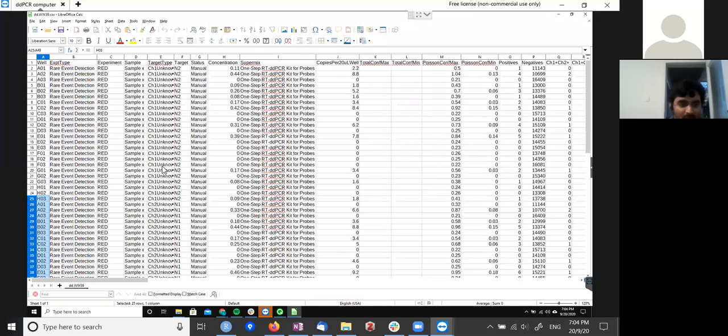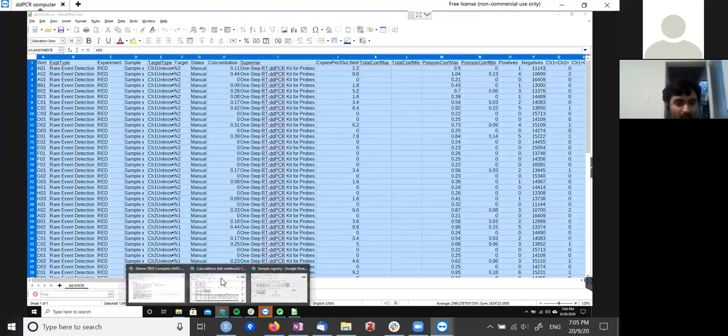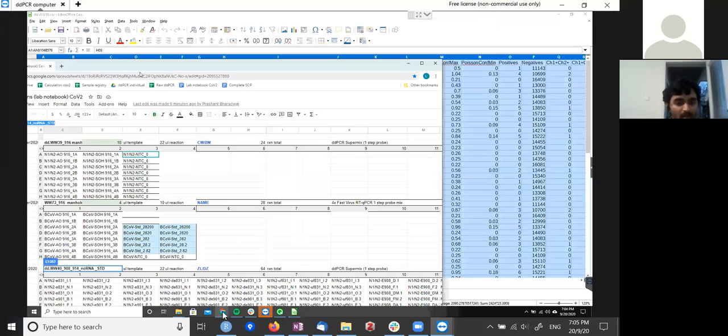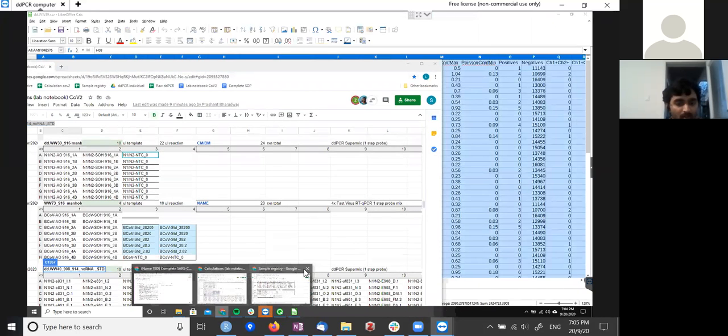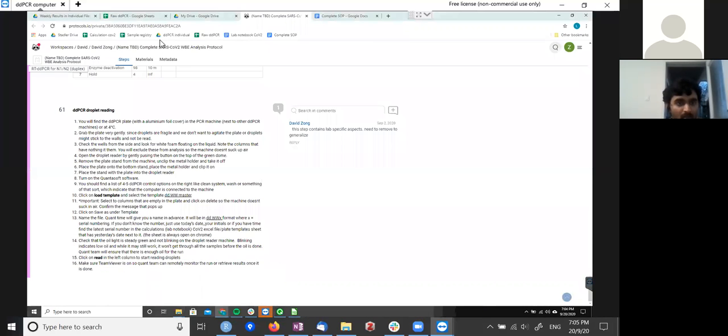So we have this information. We will copy this whole thing and paste it in this thing called raw ddPCR.